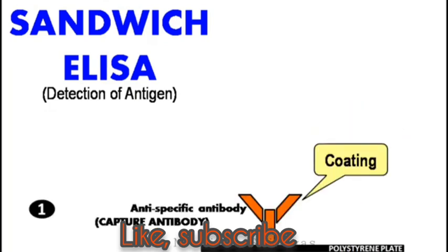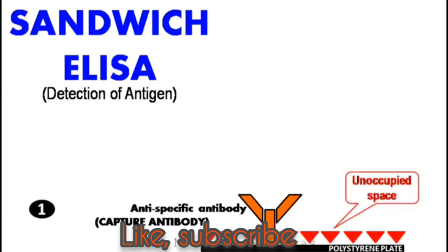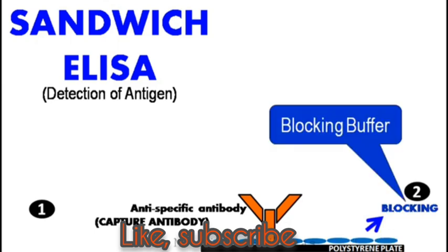In sandwich ELISA, the first step is coating the well with known anti-specific antibody, which are considered as capture antibody, since they are captured to the polystyrene surface. Following coating, incubation, and washing, the second step is blocking. Here the unoccupied spaces are blocked by using blocking buffer.